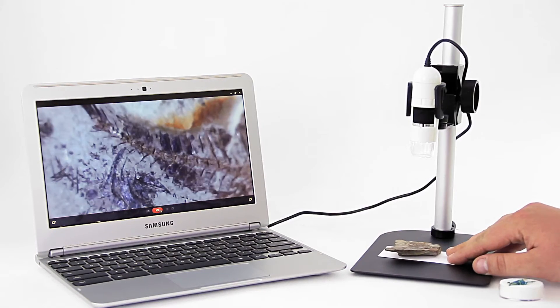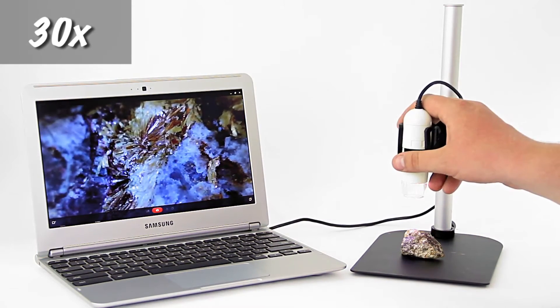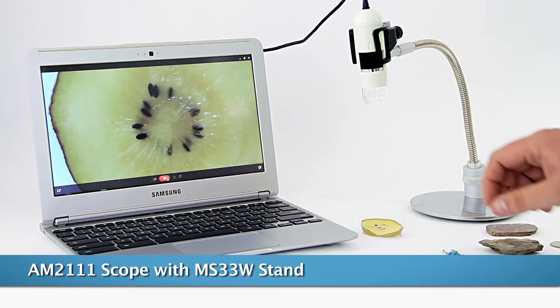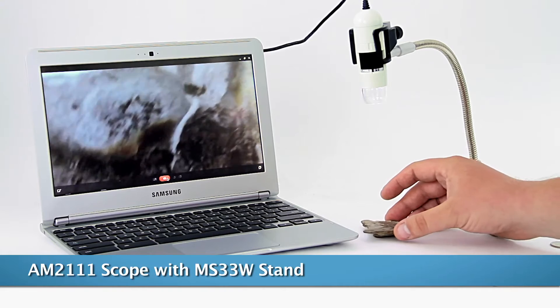User and budget-friendly Google Chromebooks have been very popular since their release, but due to their exclusive Chrome operating system, they're limited to using web apps and can't use other common software made for Windows or Mac computers.